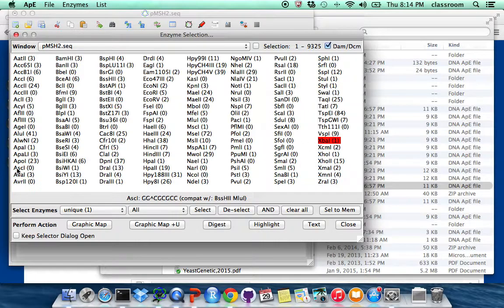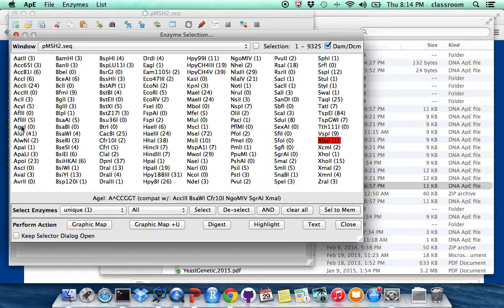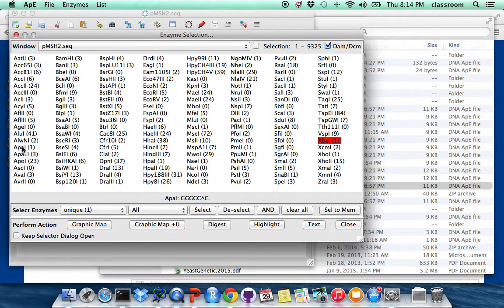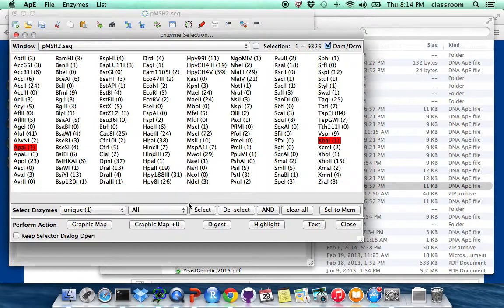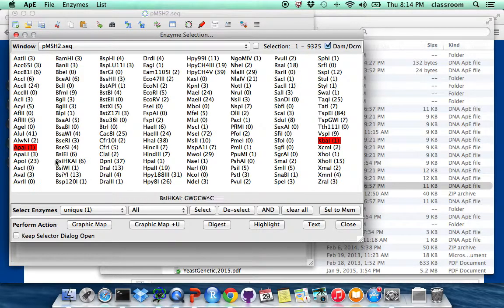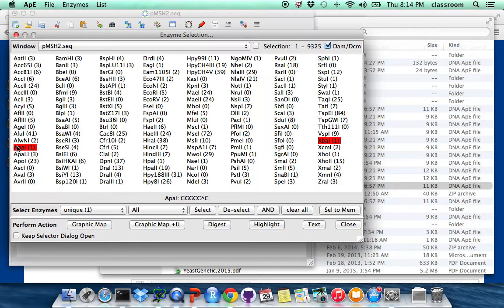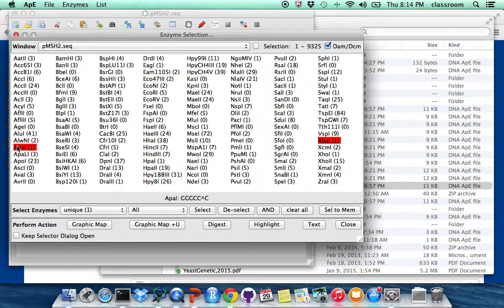And then I'm going to pick APA1. And if you look at the bottom at this screen, once I move my mouse to APA1, you will see this is GGGCCC.